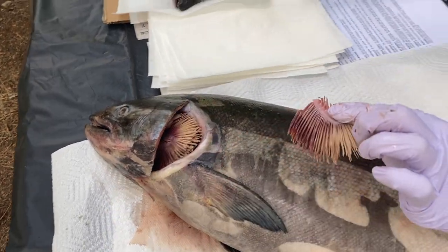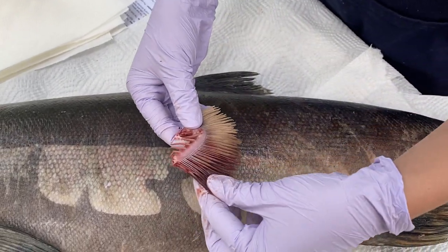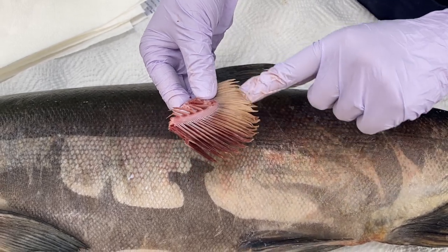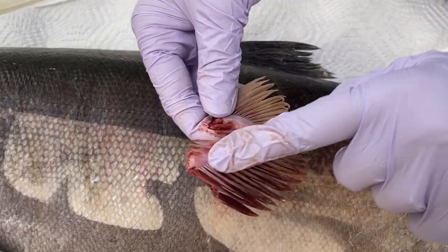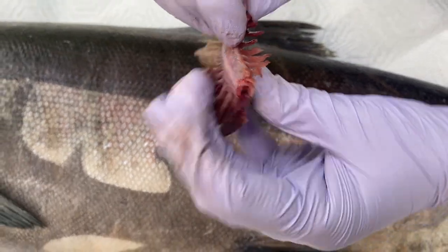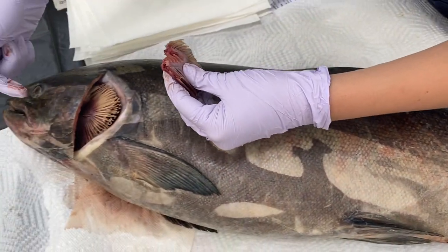Okay, so here we have a gill. And so I said before, these light parts that are really soft are called the gill filaments, and they are what are going to make sure we get the oxygen out of the water and into our body. We have this hard U shape here. That is the gill arch, and it holds the shape. And then we have these structures that look like teeth, and they're serrated and really jagged. And those are going to be on the inside of the mouth.